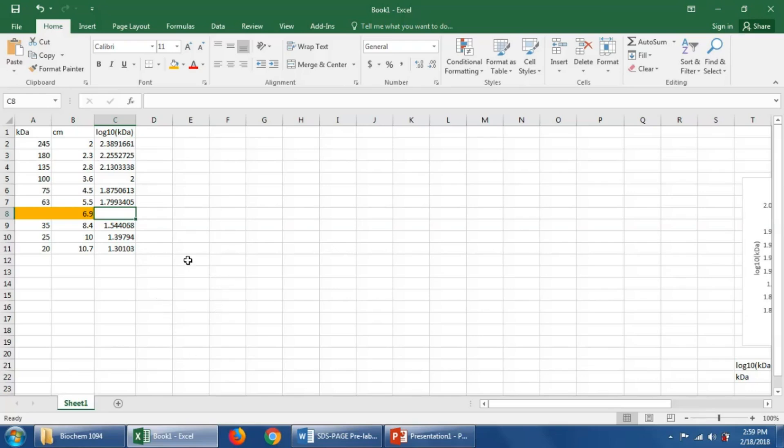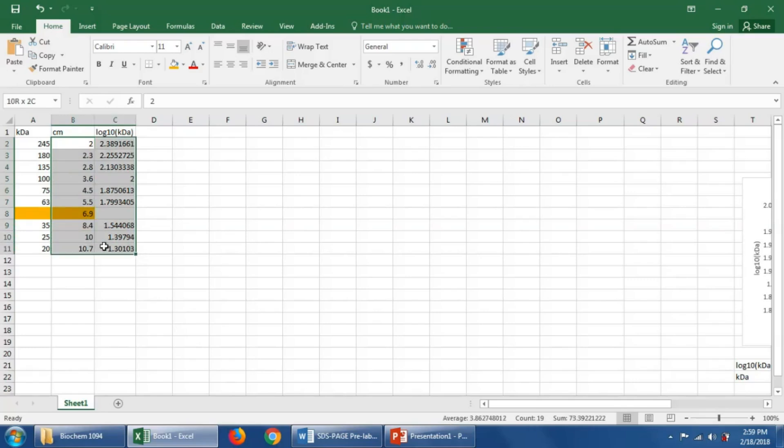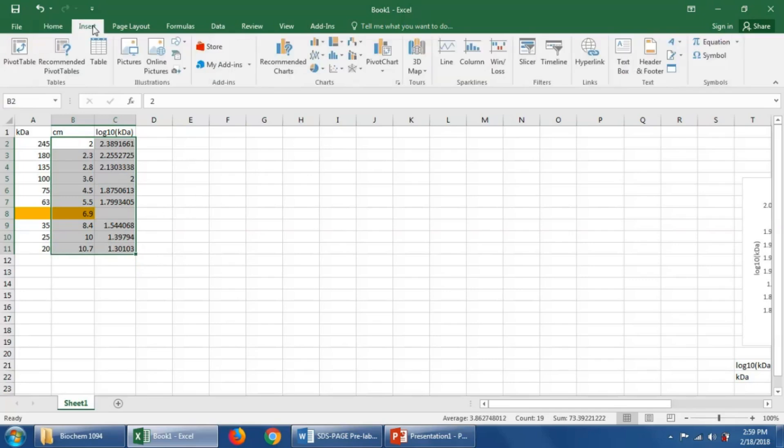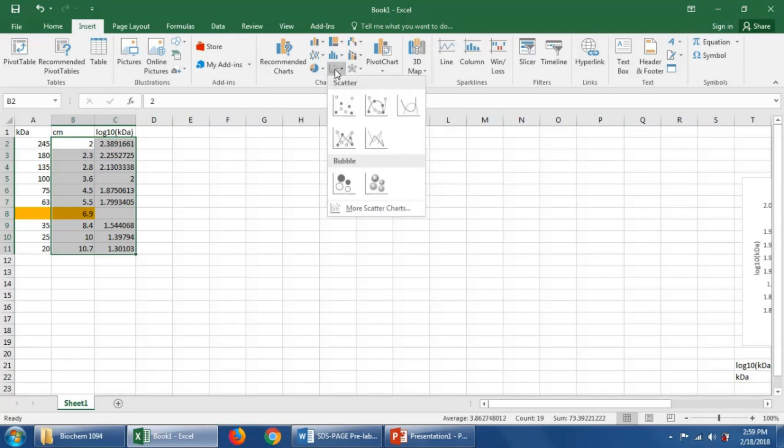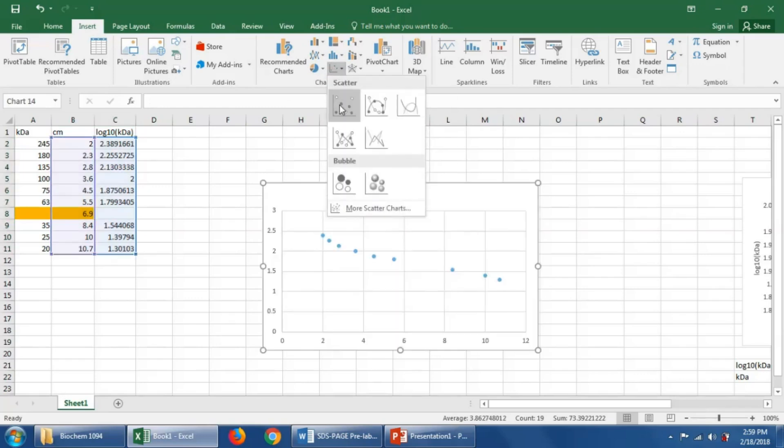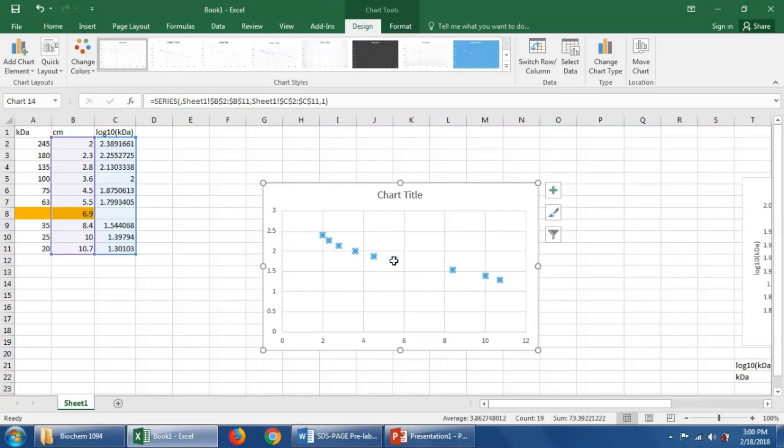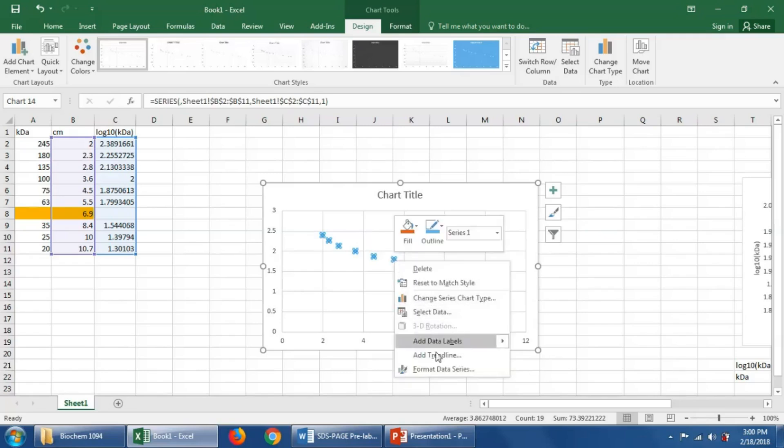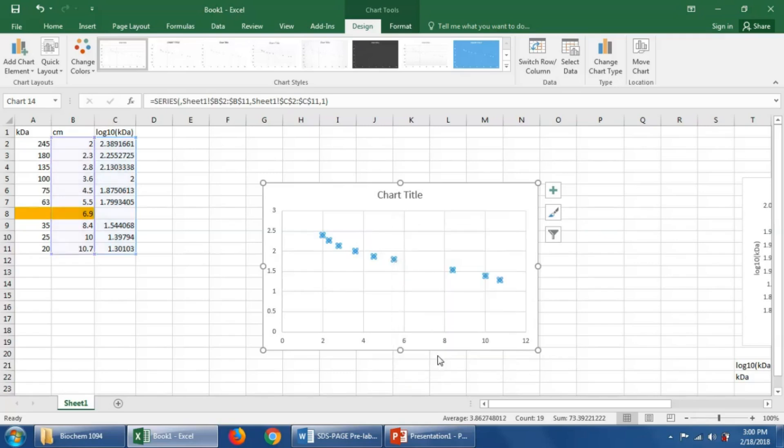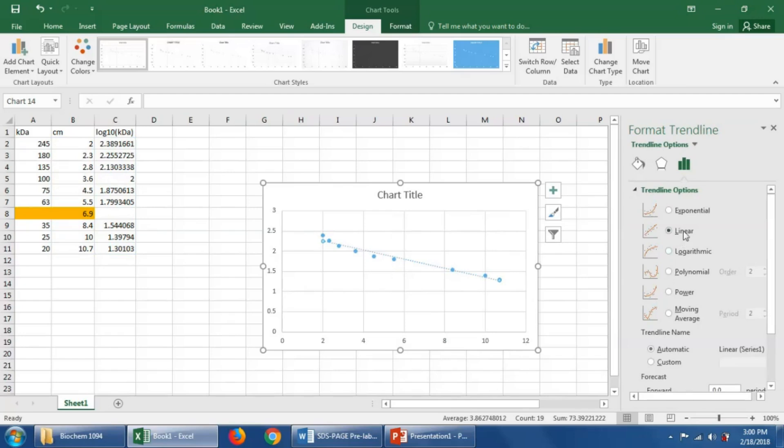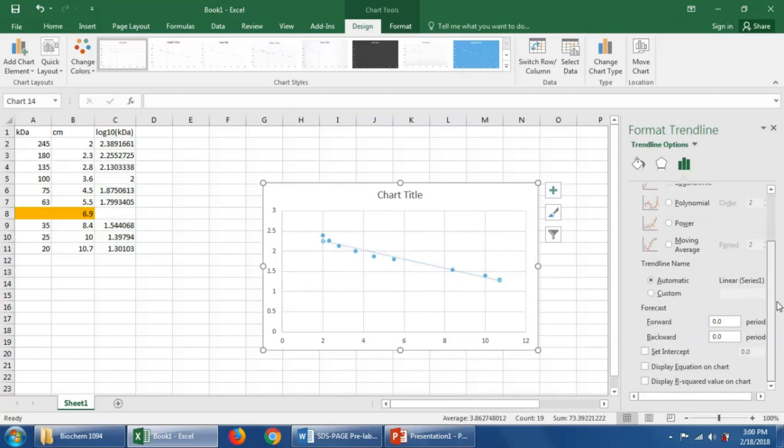So now what we could do is we could plot the migrations in centimeters by the log base 10 of the kilodaltons. I'm going to show you how to do that. So we say insert, scatter plot, and we get this. We could then click these points and then right click. On a Mac you would do this by holding control while clicking. And we're going to add a trend line. We could add a linear trend line because this relationship is roughly linear. And we could ask Excel to display the equation of that line on the chart. Here we have this equation.